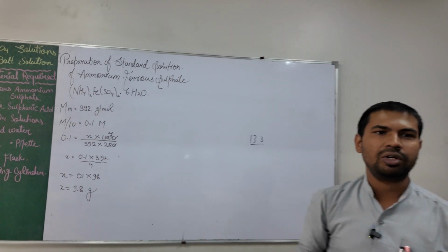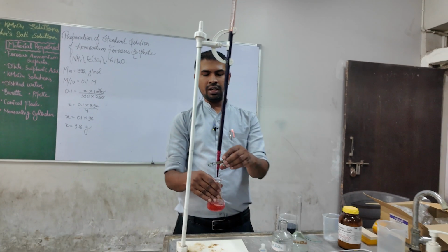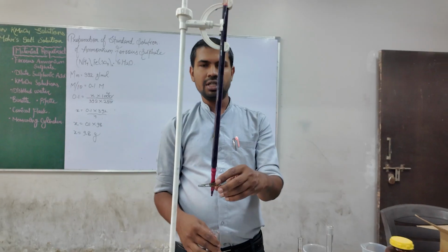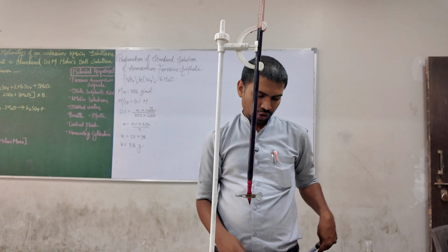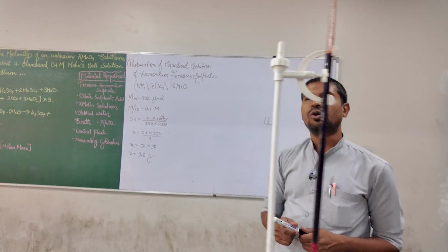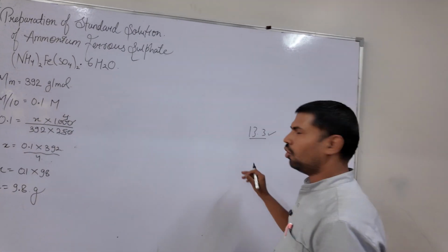So like that, we have to repeat for 3 readings, and whatever the repeated results are, that is our concurrent reading. That becomes our concurrent reading. So let me do the calculation then. Suppose we take 13.3 as the concurrent reading.